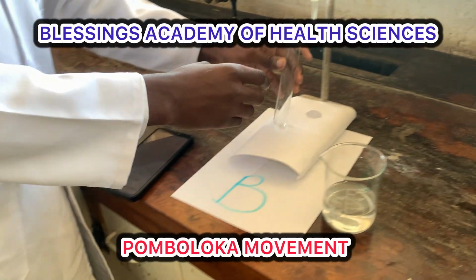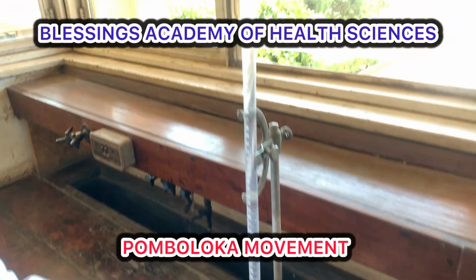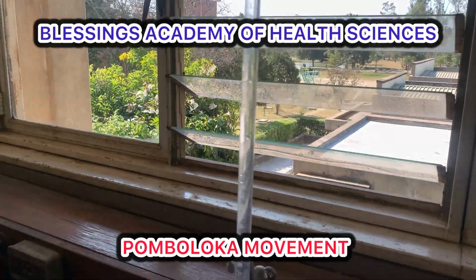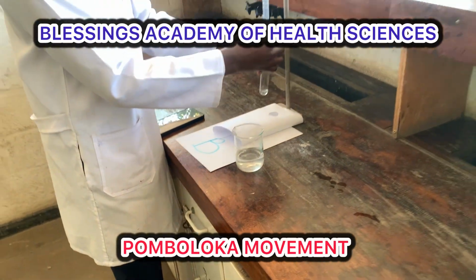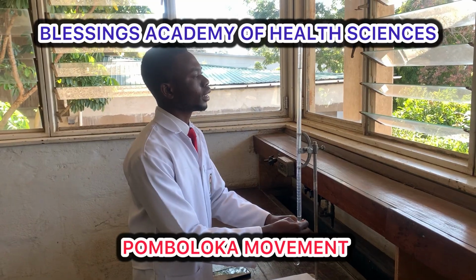So we're getting how many mils? 5 mils, starting from 0. We're getting 5 mils, and there we are.